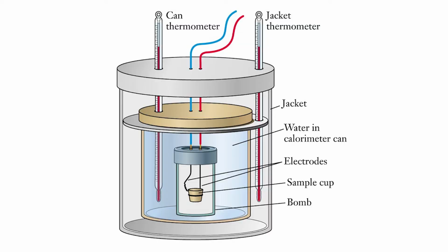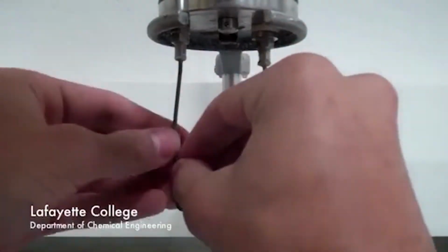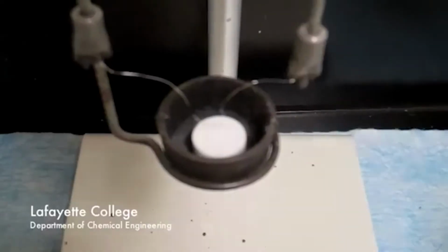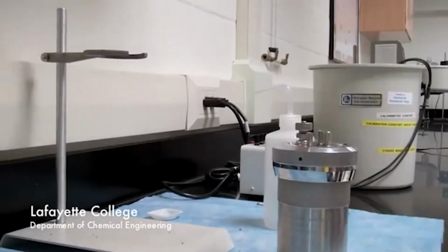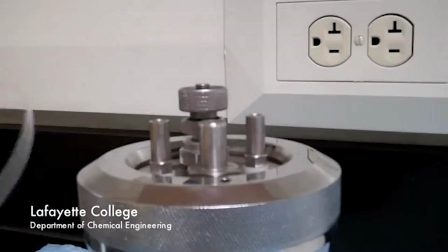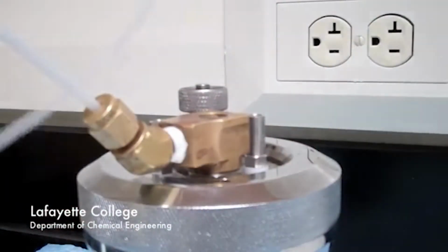Interestingly, there's a special type of calorimeter known as a bomb calorimeter. These calorimeters are used to measure the energy produced by a reaction that yields large amounts of heat or gaseous product, such as a combustion reaction. One of the most important uses of these calorimeters is for measuring calories in food. A calorie is exactly 4.184 joules, and a kcal, commonly used outside of the US, is 1,000 calories and is the exact amount of energy needed to heat 1 kilogram of water by 1 degree Celsius.